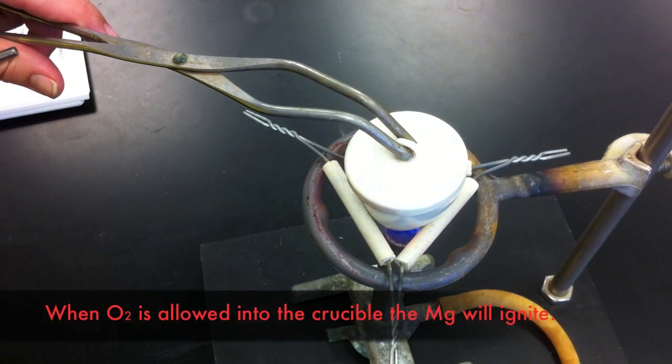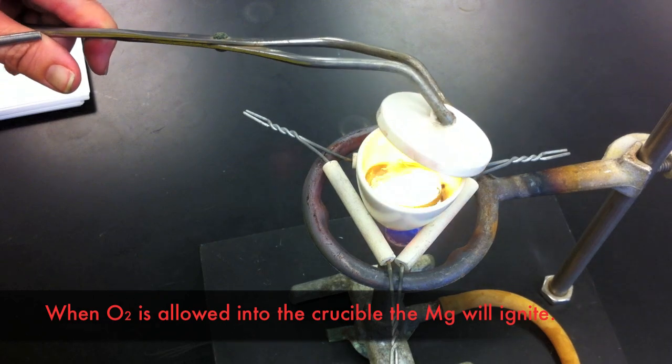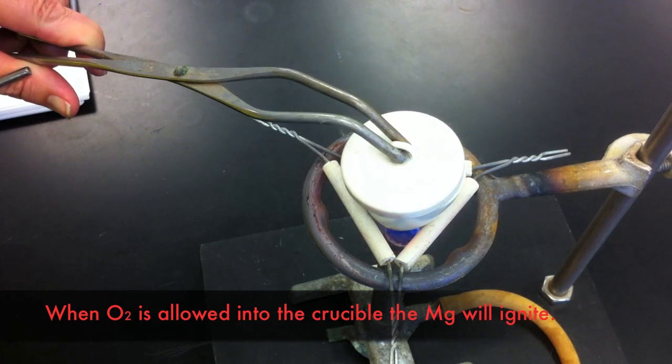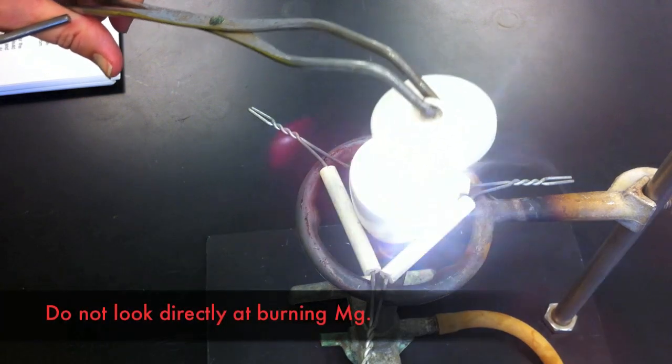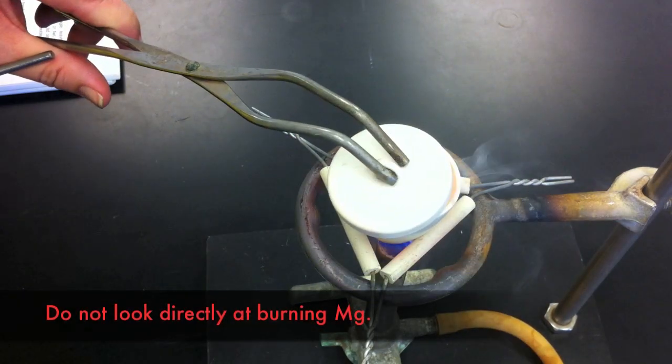Raising the lid of the crucible will allow oxygen from the air to enter the crucible. This will ignite the magnesium, causing the formation of magnesium oxide. Do not look directly at burning magnesium. The intense light can damage your eyes.